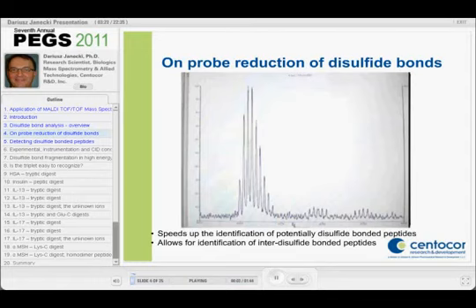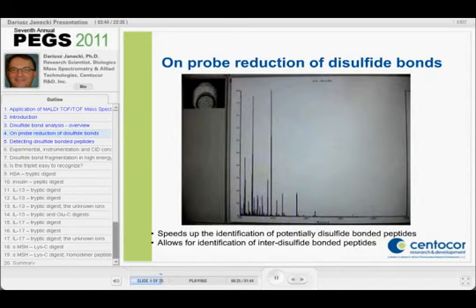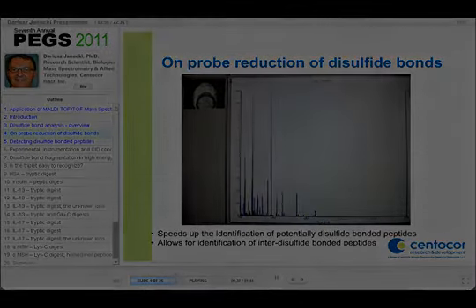I generally look at the MALDI mass spectrum and apply the reduction on probe to very quickly scan the MS window to see what peptides are actually being reduced and what is missing after the reduction on the MALDI probe. The reaction is set up really quickly. This is the tryptic digest of HSA on the probe, and you will see the two spots that were not reduced on the probe, and I will specifically show you this peak here, zoom in on this area.